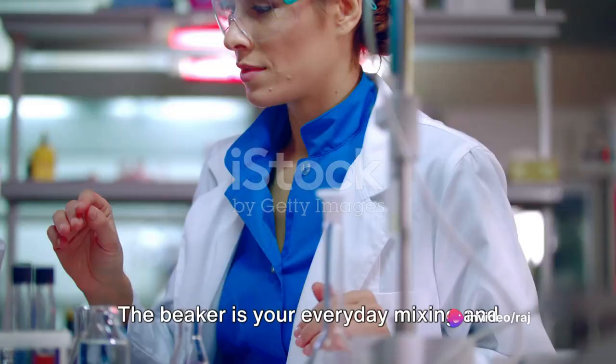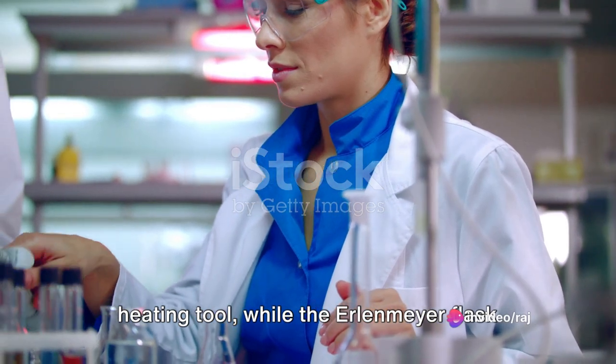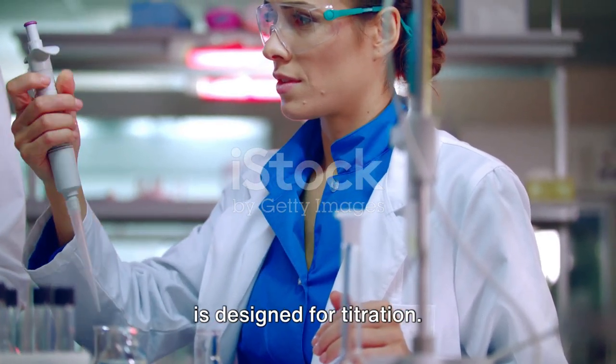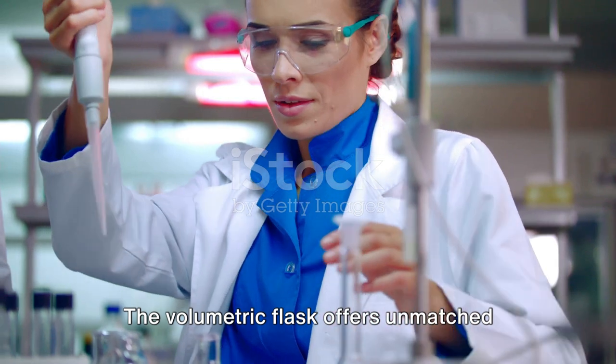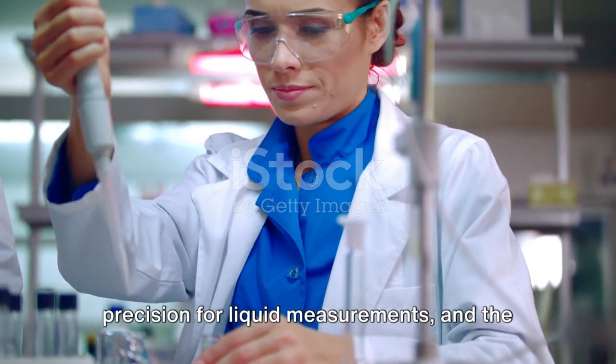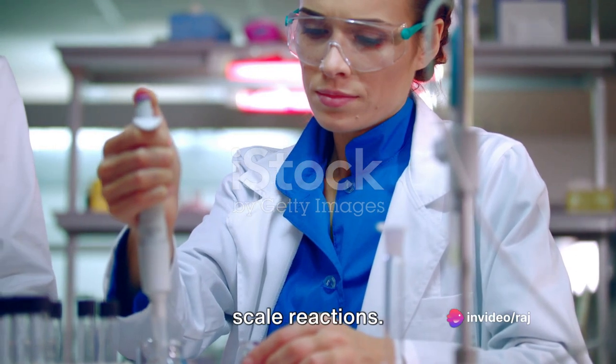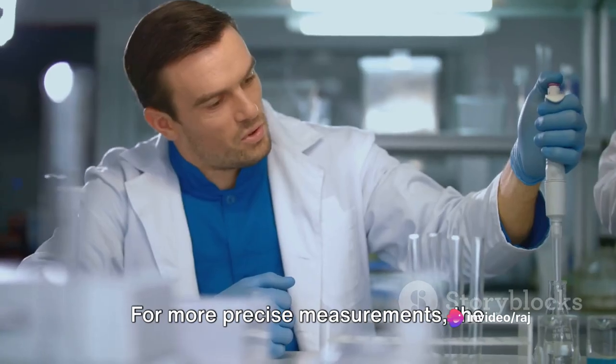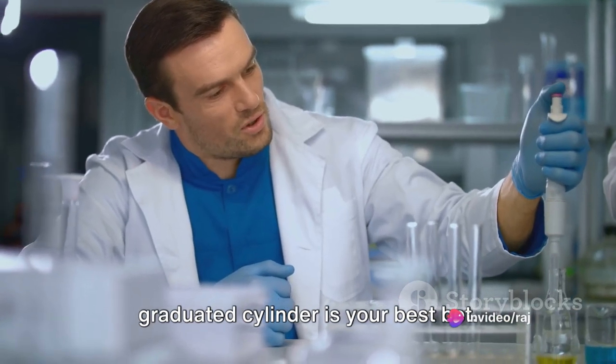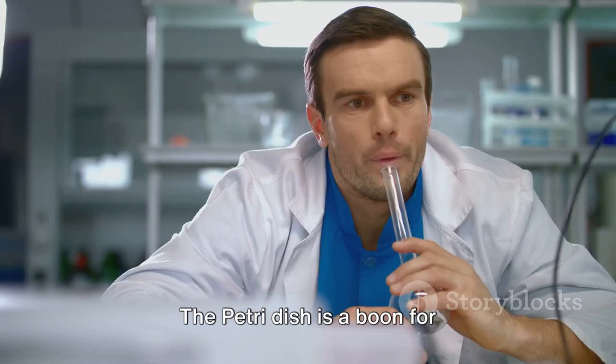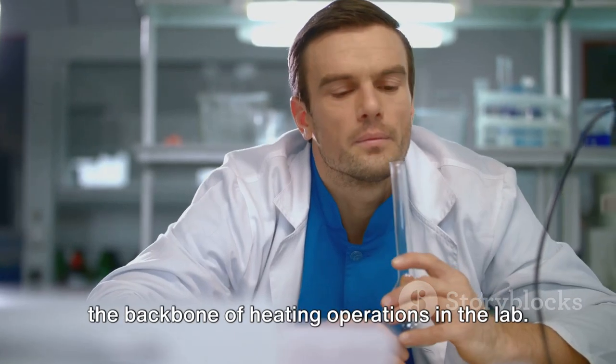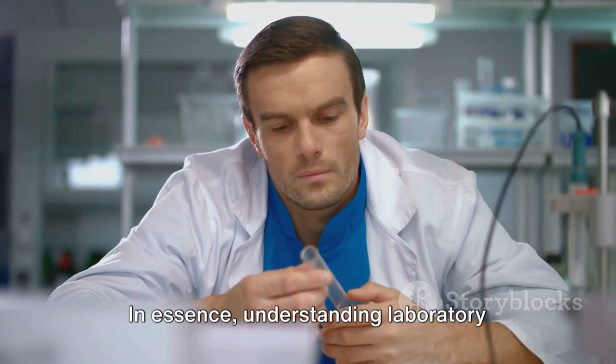The beaker is your everyday mixing and heating tool, while the Erlenmeyer flask is designed for titration. The volumetric flask offers unmatched precision for liquid measurements, and the test tube provides a safe space for small-scale reactions. For more precise measurements, the graduated cylinder is your best bet. The Petri dish is a boon for microbiologists, and the Bunsen burner is the backbone of heating operations in the lab.